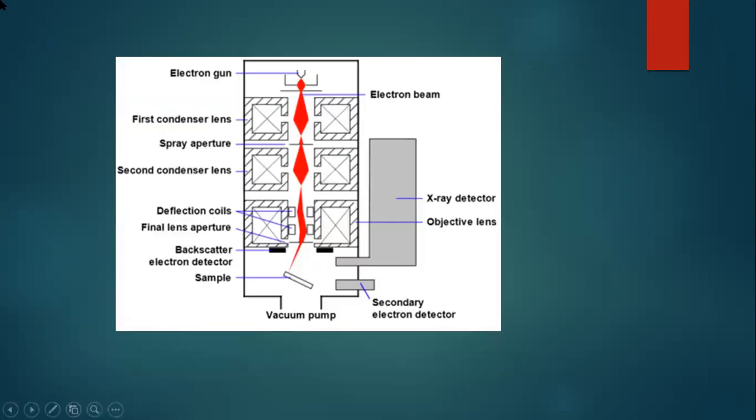And finally, today, we will talk about how the scanning microscope works. But before we talk about it, we need to know the main components of the scanning electron microscope. First of all, we should have what is called the source of electrons, the column down which electrons travel with electromagnetic lenses. Here we have the electron detector, a sample chamber, and finally a computer and display to view the image.